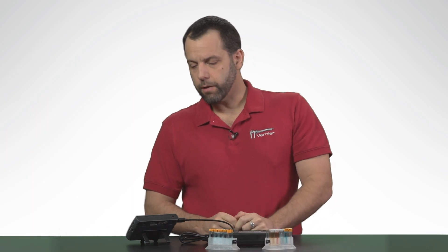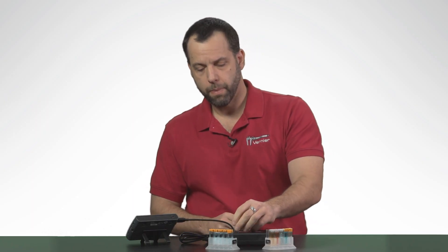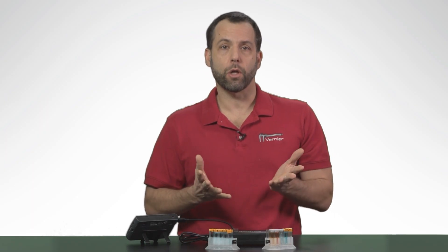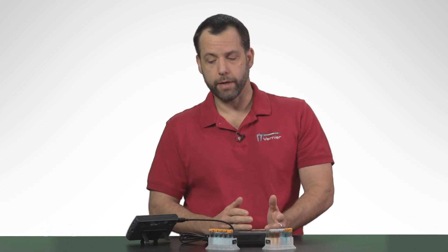The other really interesting thing about this device is that it also is a fluorometer. What a fluorometer does is measure certain compounds, like chlorophyll, that can absorb different wavelengths of light and then re-emit them — they actually glow. This is actually a really important concept in the biomedical field, and it's one of the reasons why plants are able to absorb energy from the sun and actually use it. I can show you how to demonstrate fluorescence very easily.